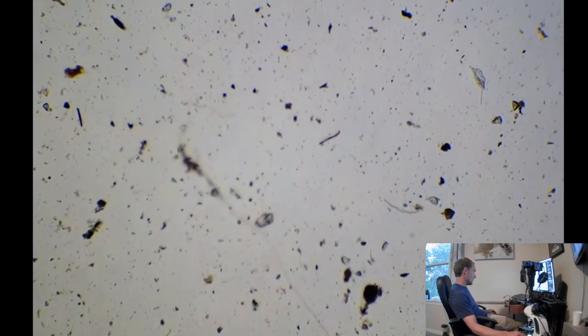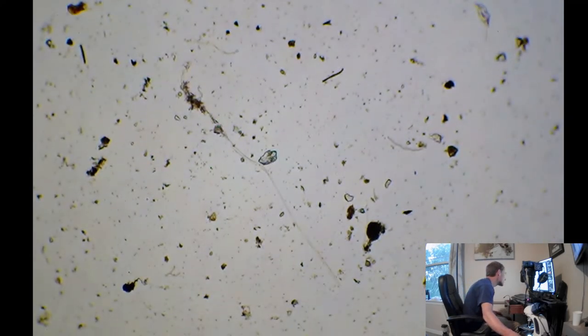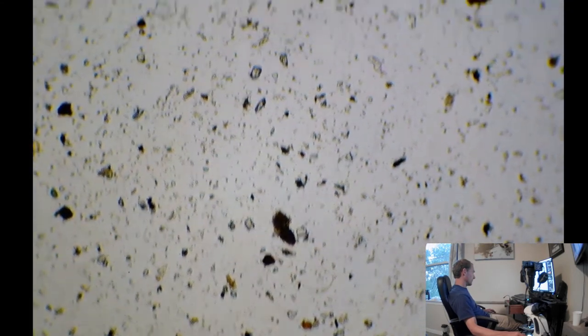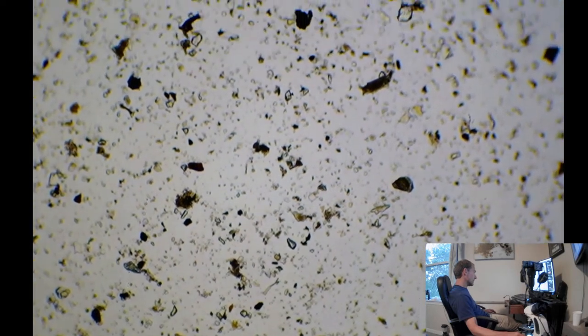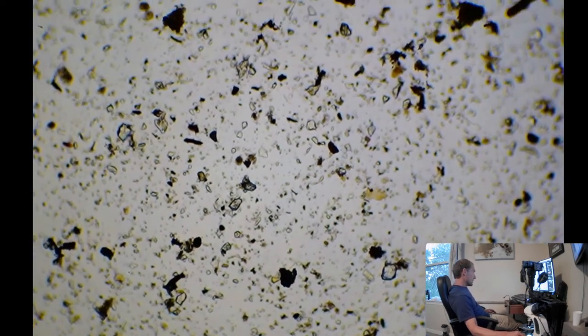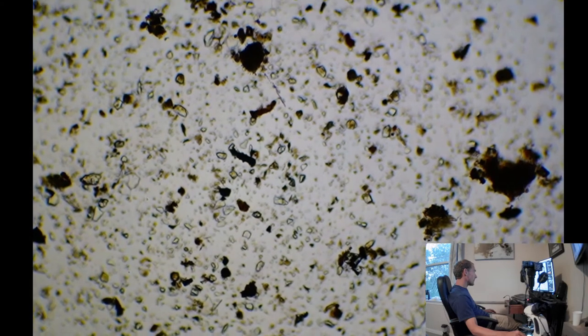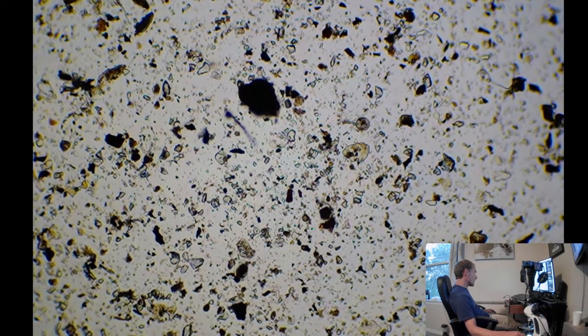We're going up before. That's another big long strand. Not seeing any septae in there though. And a lot more little clear bits over here. Hopefully they'll get aggregated soon, with the help of a little bit more fungi and bacteria too. Glue everything all together. A little bit more focus.